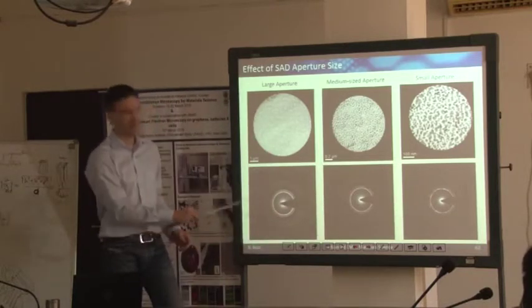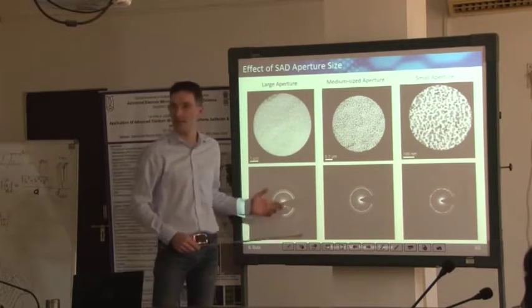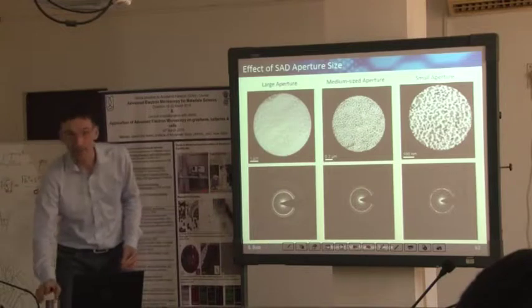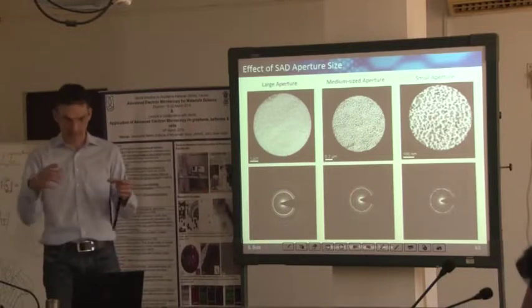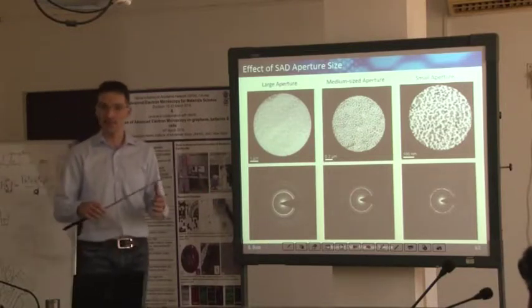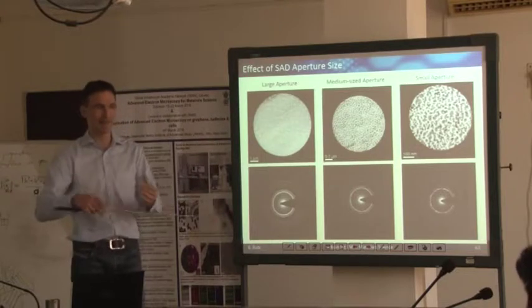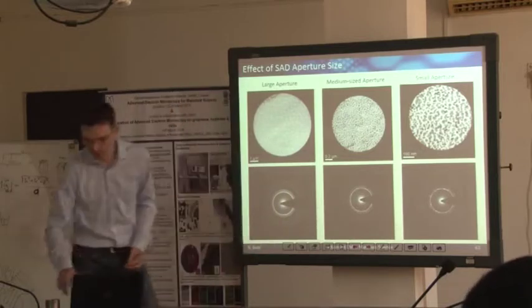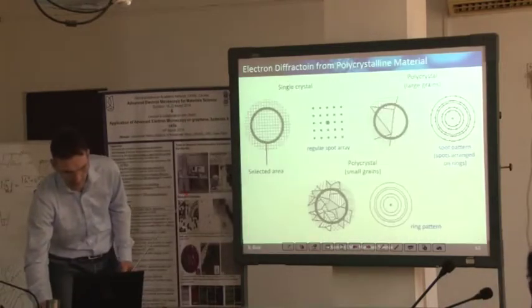For the structure analysis, it's always better to have such a defined pattern where you can clearly observe the rings, because otherwise, if there's a slight misalignment, like astigmatism in the diffraction pattern, and those rings are slightly distorted, you would hardly realize that if you only have some spots on these rings.